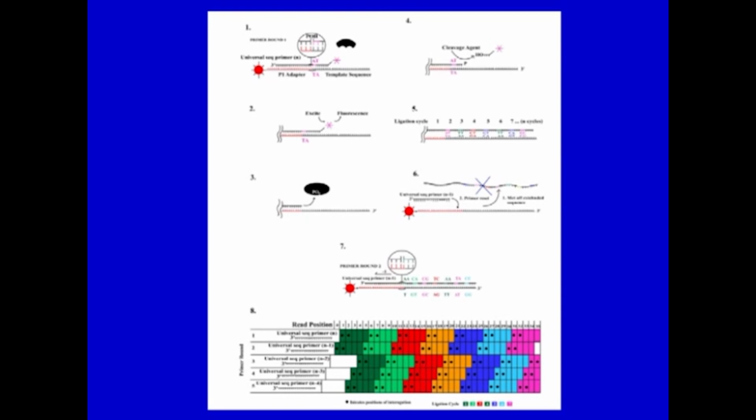So, the one which matches here will complement, then the gap here is filled in by the ligase. So, ligation is done. After ligation this is excited and fluorescence could be obtained for this, and then unextended strands and other things will be removed.